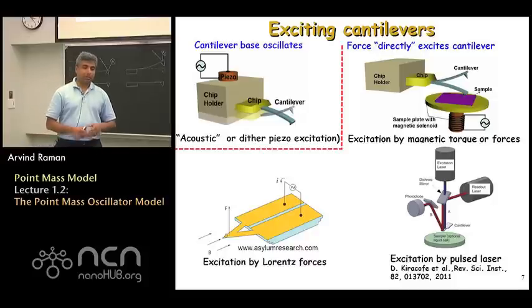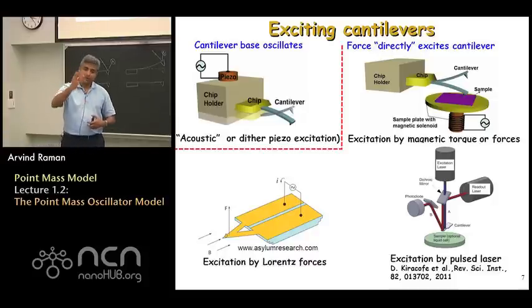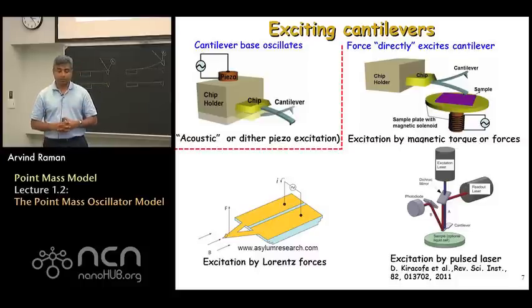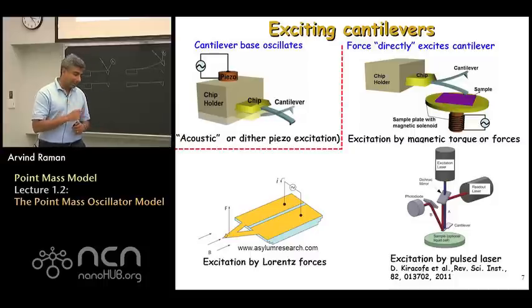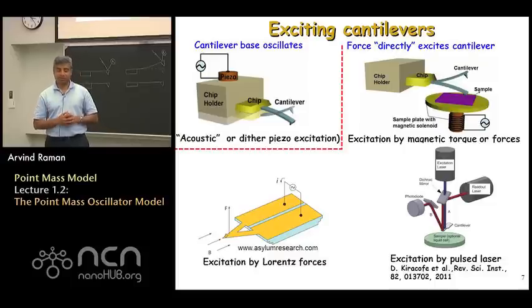Now that we have talked about what happens to the probes when there are no forces acting on them and they're just allowed to settle on their own, under their own conditions, we now are going to start talking about exciting the cantilevers, because after all, we're going to be exciting the cantilevers near resonance and amplifying the motion due to the natural resonance of the cantilevers.